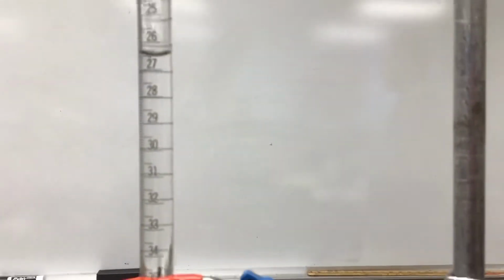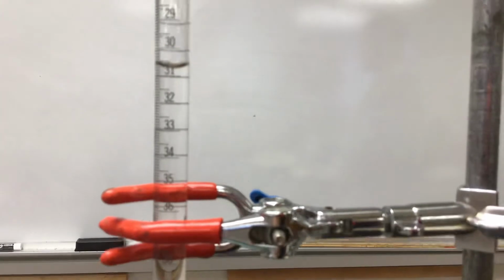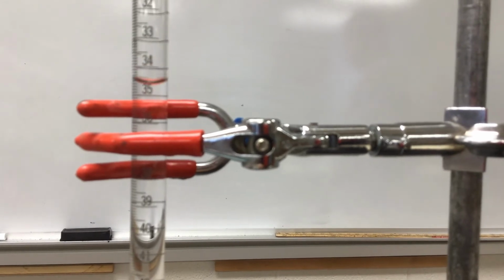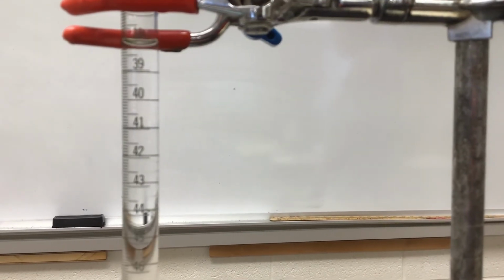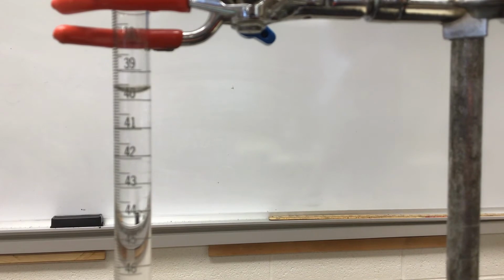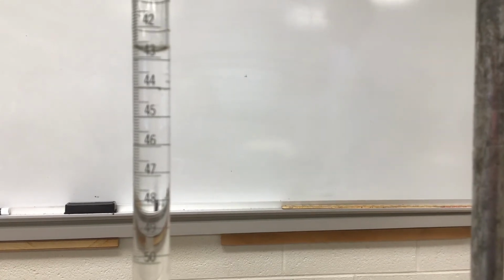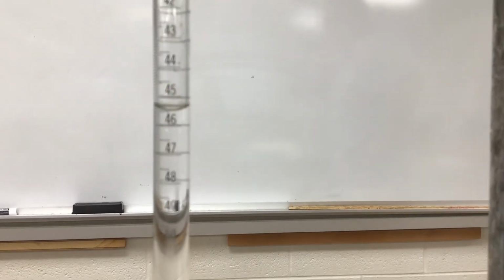This is like the chemistry version of the hourglass right here. Okay, 5 more, come on.